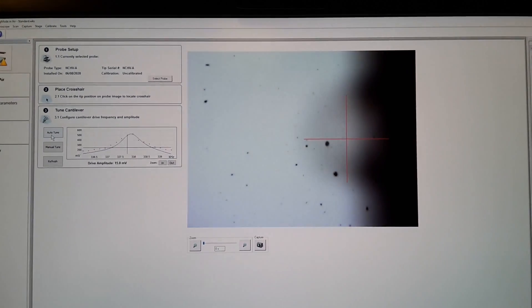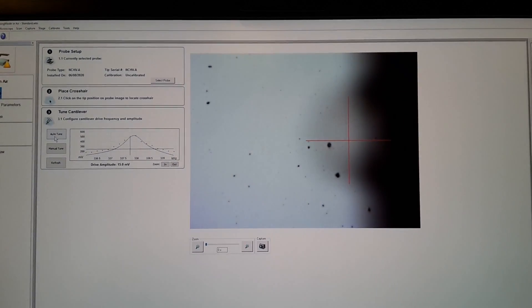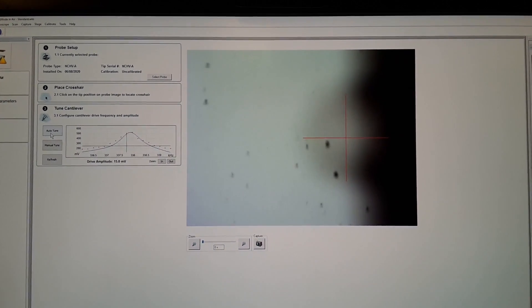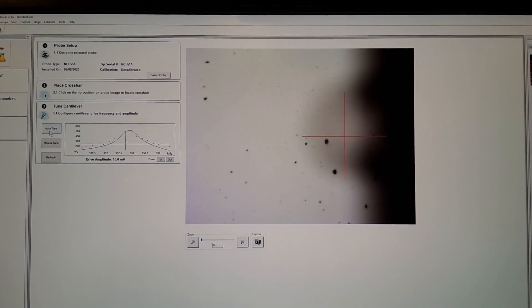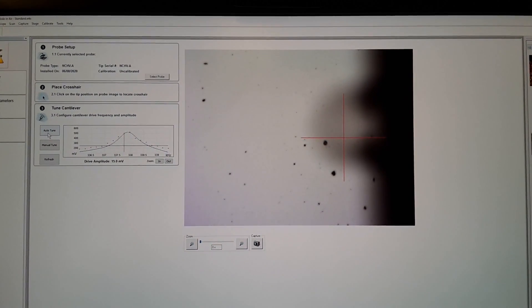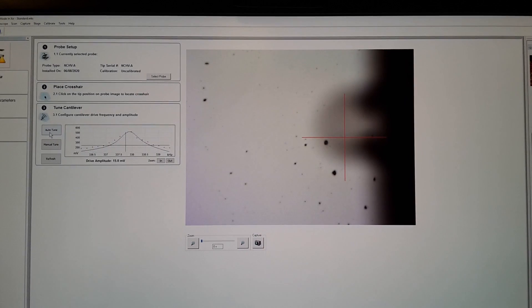You may notice the reflection from the lens as well as small dust particles within the optics of the camera tube. Continue to lower the camera to focus on the probe.